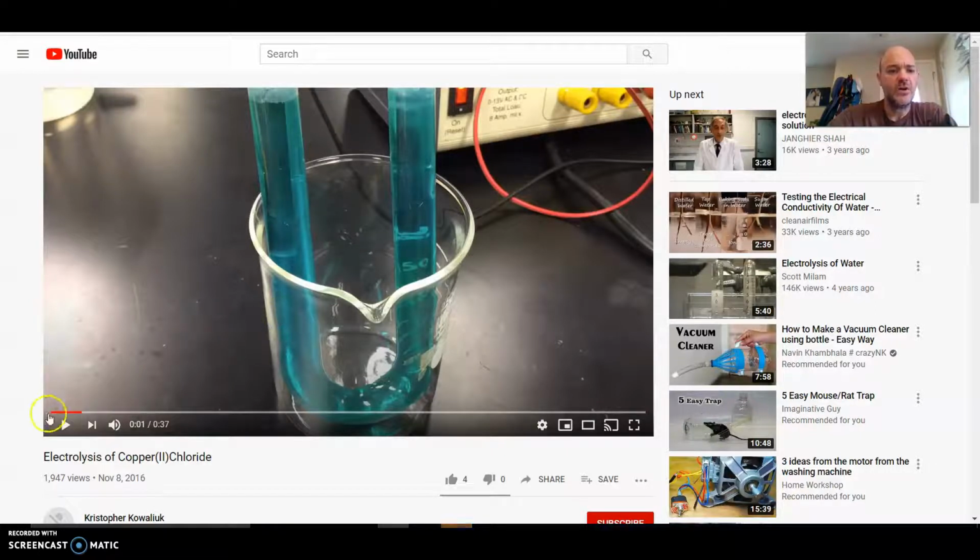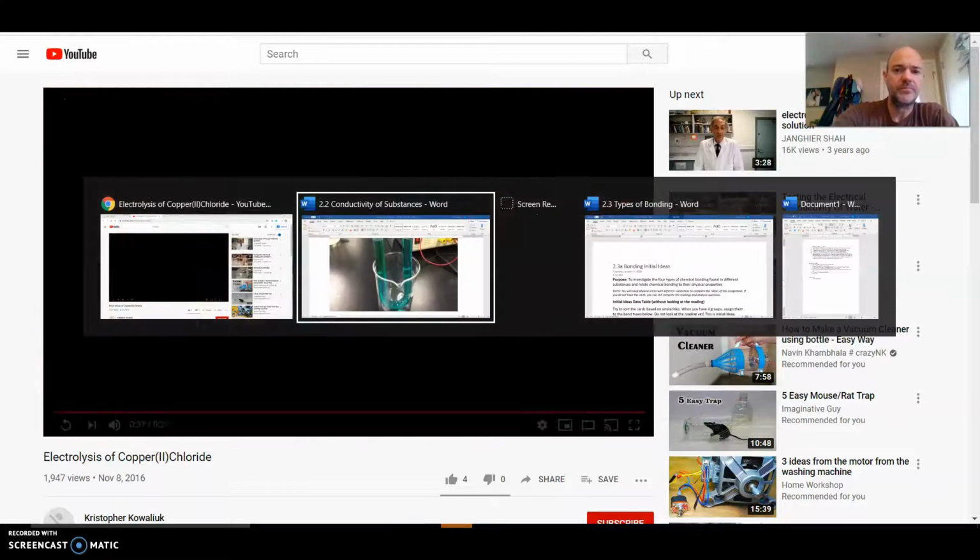Okay, so looking at this video, I will say this is a video of stuff happening over a very, very long period of time. So this video is sped up to some extent. You'll notice right here, you can kind of see, oh, look, that's pretty obviously time lapse. But we do see some stuff happening here. We see an electrochemical reaction happening. So that's one way we can look. We can look to see if there's bubbles being produced in the water. That's a great way to figure out if there is conductivity happening in the liquid. So that's one thing we can do.